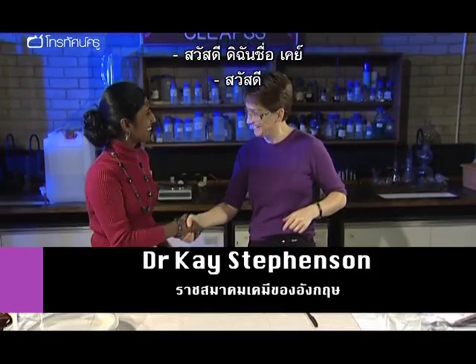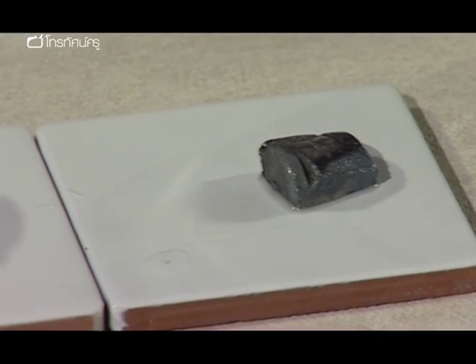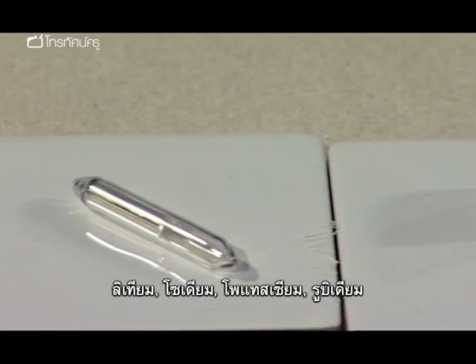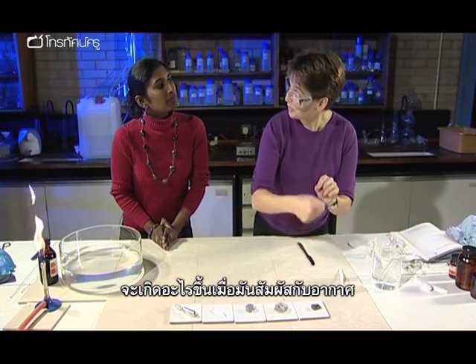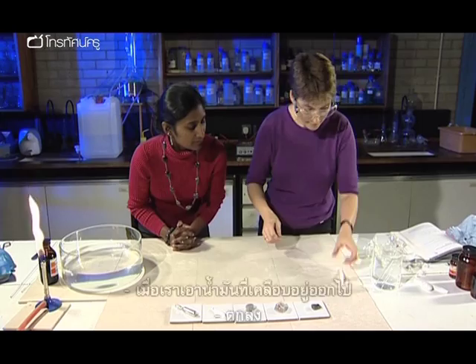Hiya, Kay. Hiya. What reactions have you got to show me then? Thought we'd start with group one. What I've done is I've got the group one elements out to have a look at, as you'd see them down the periodic table, so lithium, sodium, potassium, rubidium and cesium. And what I thought we'd do is just have a look at how easy they are to cut and then see what happens when they're exposed to the air, when we clean off the oil layer.